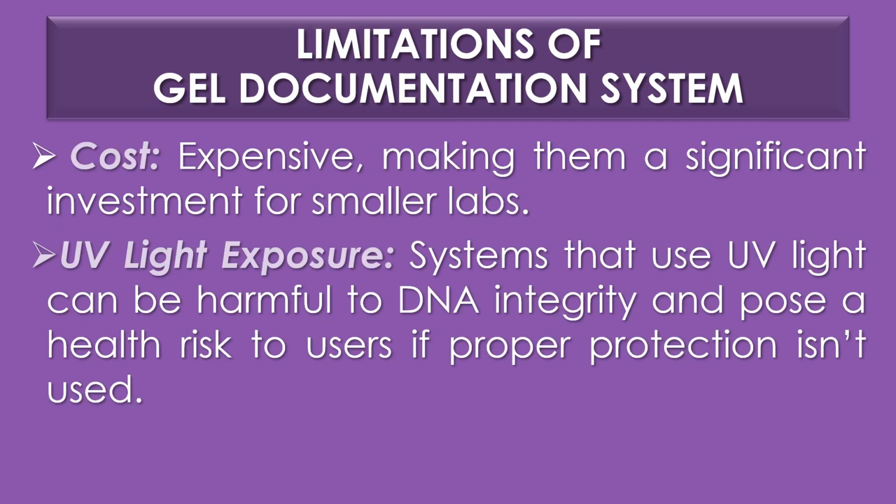Limitations of gel documentation system. There are two limitations. The first limitation is cost. Gel documentation systems can be expensive, making them a significant investment for small labs. The second limitation is UV light exposure. Systems that use UV light can be harmful to DNA integrity if the gel is to be used for subsequent applications, and it also poses a health risk to users if proper protection is not used.